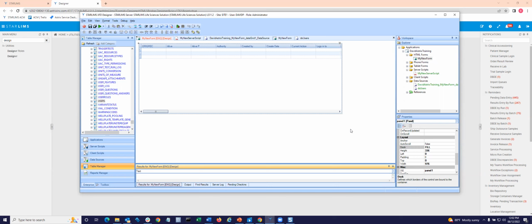I think as an overview, it seems like a good start. Probably one of the more helpful things was seeing all the different types of forms or fields you can put in. And I think it's good that we didn't get too far into the weeds, since it's sort of the introduction, the first time we're seeing this. Yes.